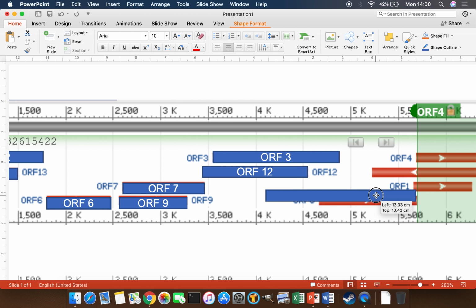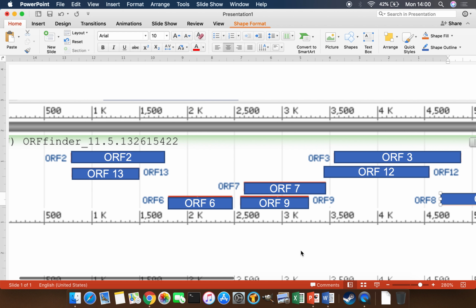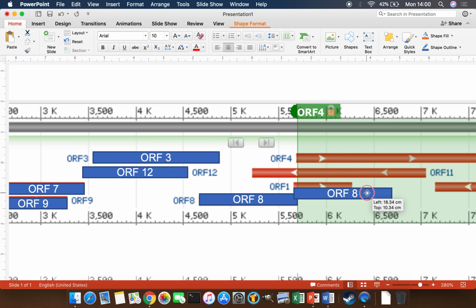oh yeah. So we had that end right, and we completely got that end wrong. There we go. That's about right. And it is open reading frame 8. Okay, awesome. And so these are things that we have in there. And let's get open reading frame 1 just so we can start out with that. Okay, that's about the right start position. There's the right end position.